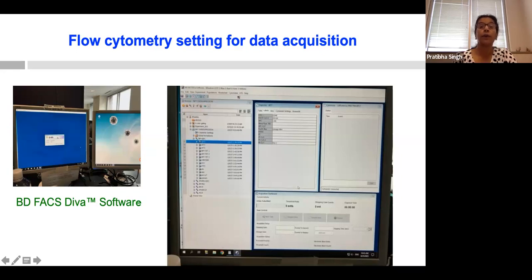I normally write down the type of tissue I am using and the particular phenotypic analysis I am doing, so I put bone marrow HSPCs. For the tubes, you can put what specific sample is in that particular tube. Here we had wild type mice cells and NPY overexpressing mice derived cells. It just depends on the way you want to write.